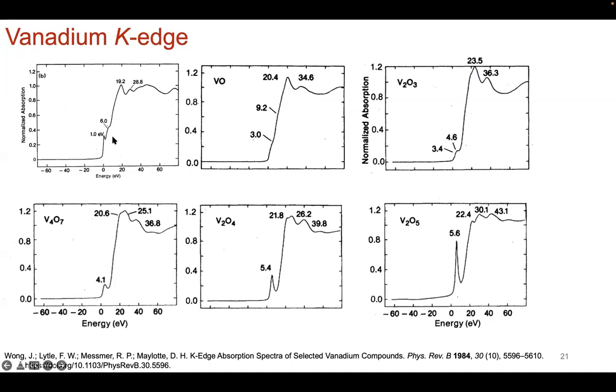So let's look at the absorption edge here at 0. The absorption edge increases more. So the shift now, the absorption edge is almost 20 eV above where it used to be. It used to be 0 for metal. Now at +5, the highest oxidation state you can have for vanadium, it is about 20 eV above where it used to be. And that's how you calibrate. You have to calibrate towards the metal. And the pre-edge regions grow as well.